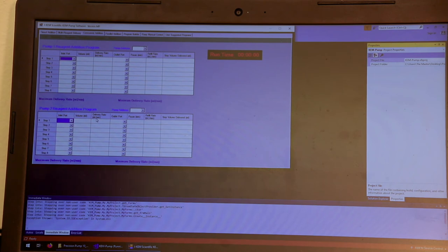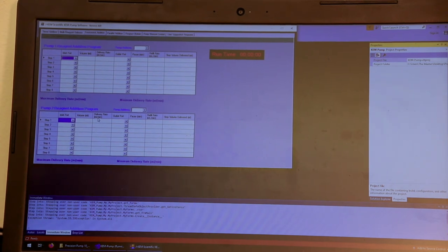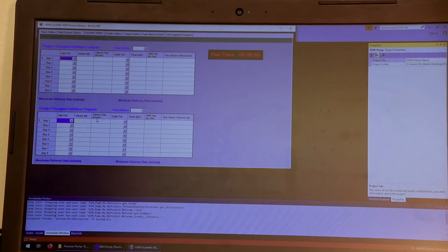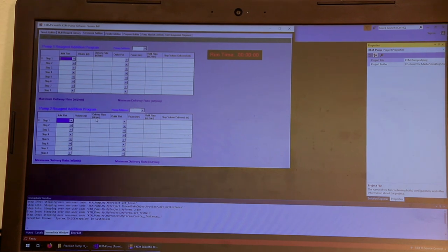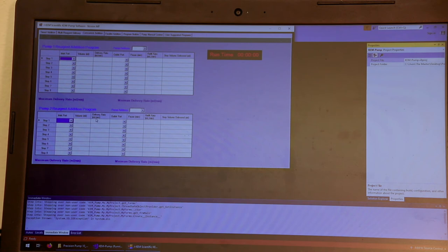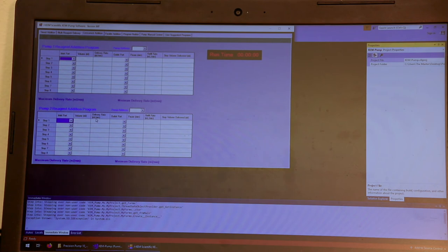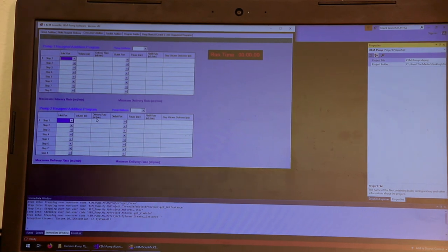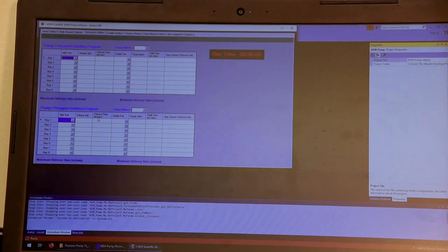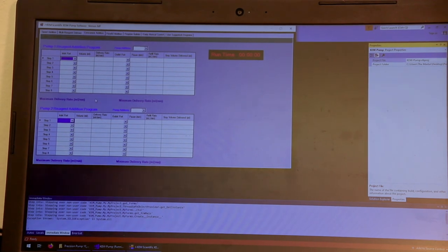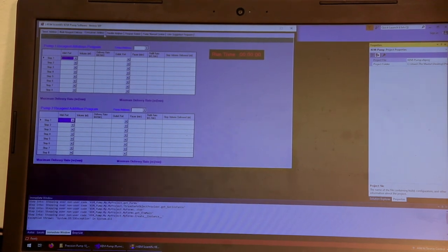You could use that, for example, to add two reagents concurrently to a single reaction. For example, if you were doing a polymerization reaction, maybe on pump one, you might want to add 200 milliliters of a monomer in an hour, and on pump two, you might want to add half of a milliliter of a free radical initiator. And you can do those in parallel with one another on that experiment.